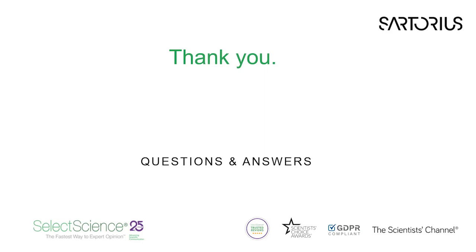Great, thanks a lot for that one. And I have another question here from an attendee: using the same pipette for a long period of time can affect the pipetting as it increases the temperature. How long can you keep using the same pipette in one session? That's a really good question. So yes, you're absolutely right. As you're holding a pipette, it can warm the air column, so that starts to have an effect.